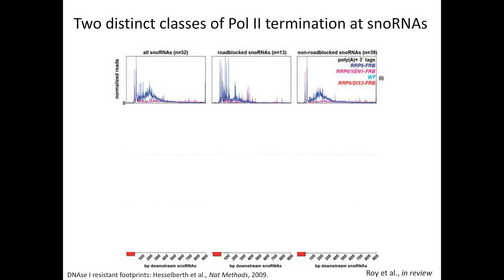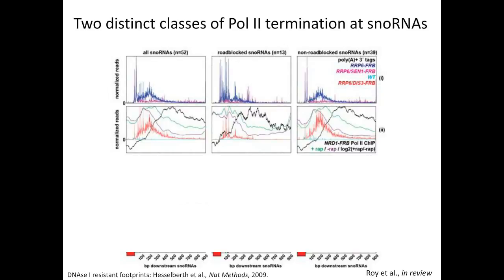So on the far right are the peaks where we did not identify a DNA binding protein downstream. We can see a much broader termination region that peaks around 250 base pairs downstream. In the presence of DNA binding proteins, the termination peaks are much sharper. And both of these termination peaks are highly depleted when we remove the SEN1 factor from the nucleus, indicating that these are NNS termination events that we're identifying.